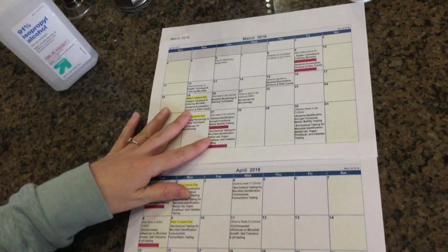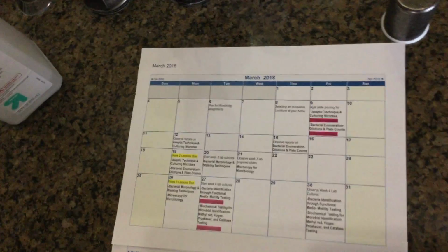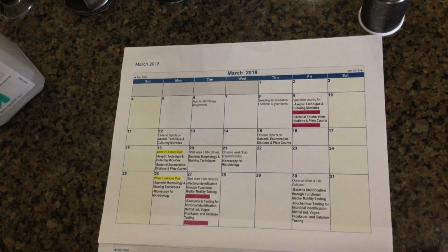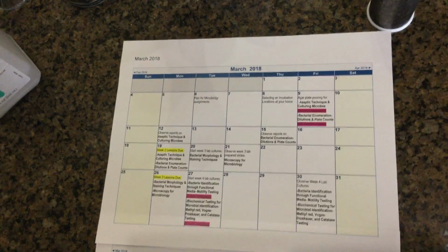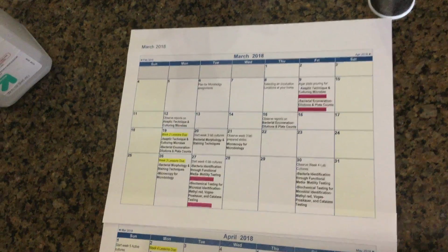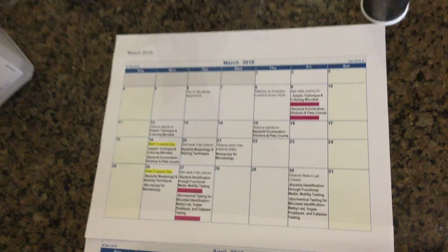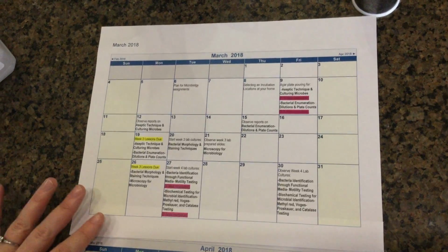So as you can see on the calendar here, we had to make a calendar and make sure we include the incubation days, when we would observe our reports, and when we should start our labs for the future weeks. So like I said, since the lab next week has 2 of them and one of them has 5 days, even though it's not Monday yet, I'm still working on that lab, getting all my agar plates and cultures set up because of the incubation times.